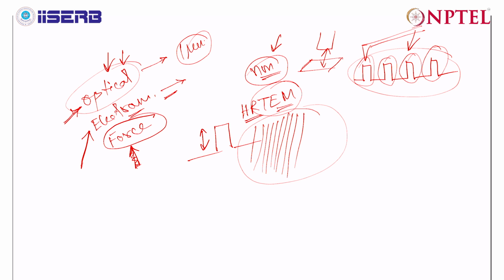He also uses a kind of stick and taps it in different locations in order to find how the surface is ahead of him. It's very close to that phenomenon, and then you can get information about that substrate in 3D. That is not possible in case of TEM or FESEM, right? So these are the imaging techniques, and one has to decide the imaging technique based on the need.